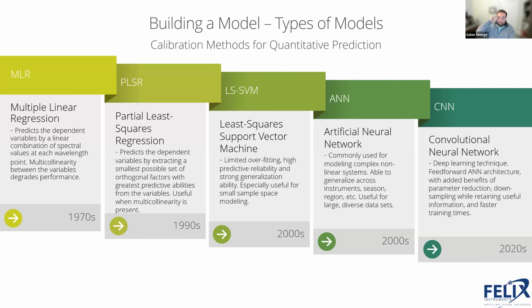So before I get into any formal recommendations for this whole process of choosing spectra preprocessing, wavelength selection and model types, let's first look at 2 use cases, and I can use those to help you understand how to choose between all these different methodologies. Our first use case is a Chinese farmer that grows a single variety of jujube from a single orchard and wants to build a model to non-destructively predict their soluble solids content. So this is a quantitative predictive model, and they only want to deploy it on a single instrument, a single F750.